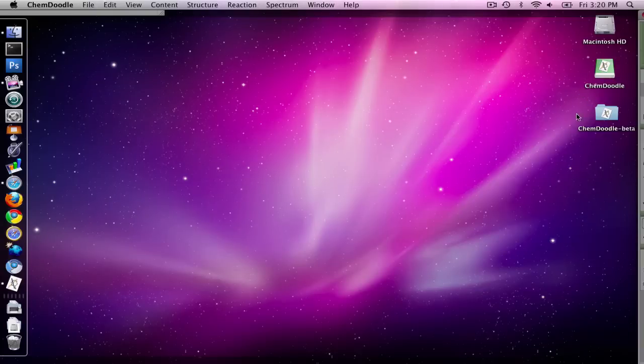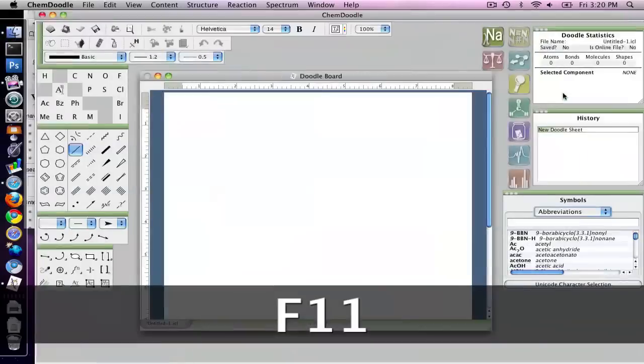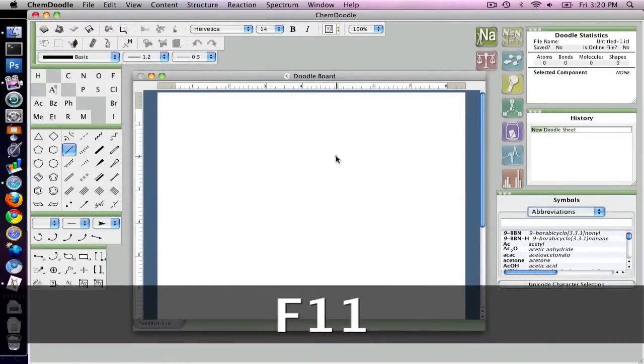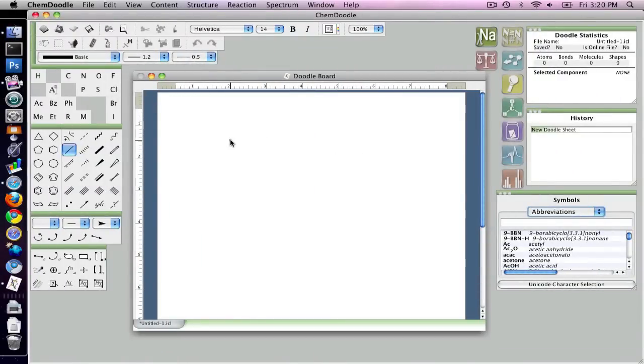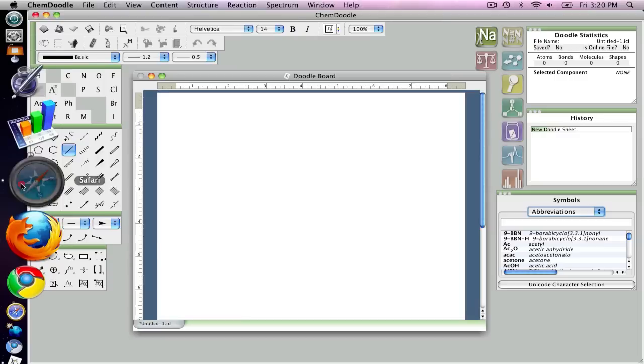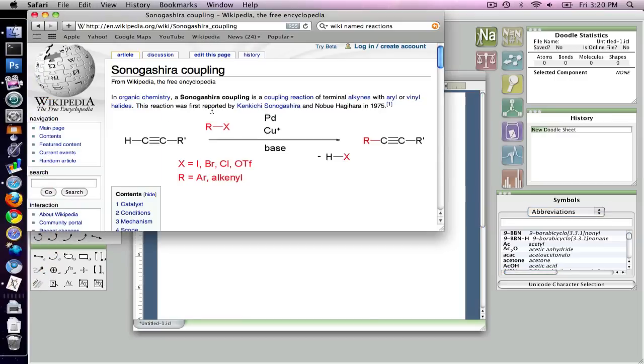So today I have ChemDoodle 3 beta with me and I'm going to use it to briefly show off how to use the reaction building system to build simple reactions. And I will be building the Sonogashira coupling reaction, which is displayed on the Wikipedia page.